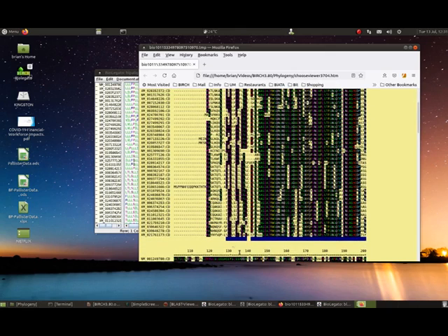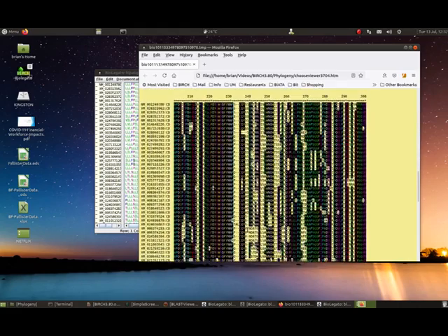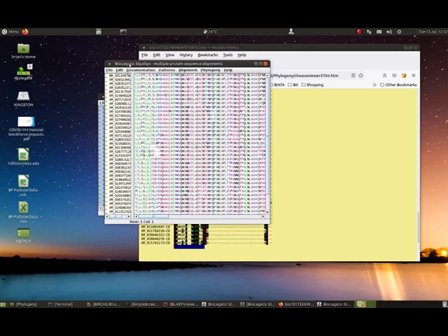So it actually gives you the alignment, but the great thing is it uses a blue line to underscore those positions that remain in the final output, and the ones that don't have an underscore are going to be excluded from the output. So you can see this big gappy region is entirely excluded. And so now we have a much more realistic subset of the alignment to work with.